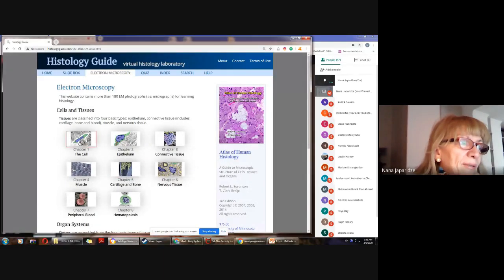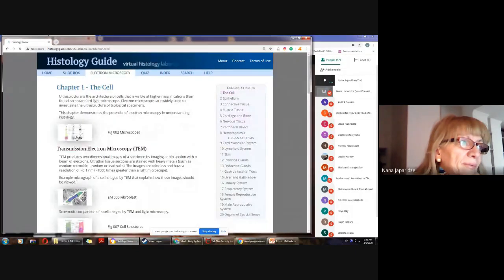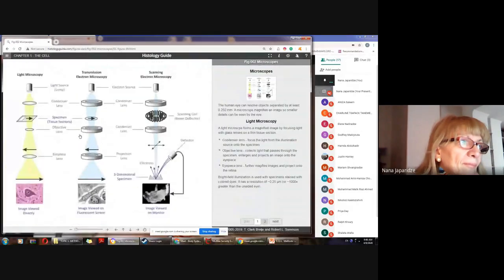So look, first of all, here are described these methods via which we can obtain main principles of these microscopical techniques.